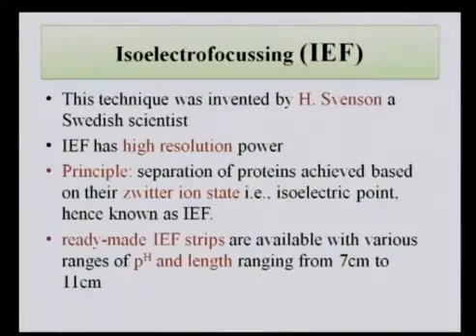As we discussed in the previous sessions, in SDS-PAGE we prepare the gel on our own. Whereas to perform IEF, there is no need to prepare the gel, as there are commercially available strips, which we call IEF strips, and these strips come with different pH gradients. Like you can see here, these IEF strips come in various pH ranges, and the sizes also range from 7 to 11 centimeters.